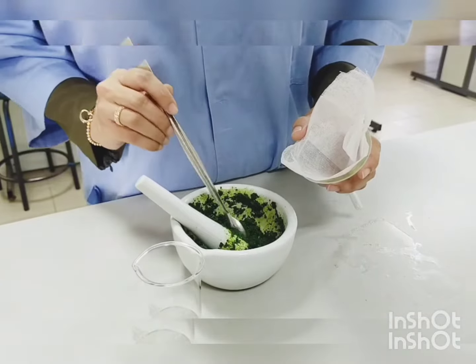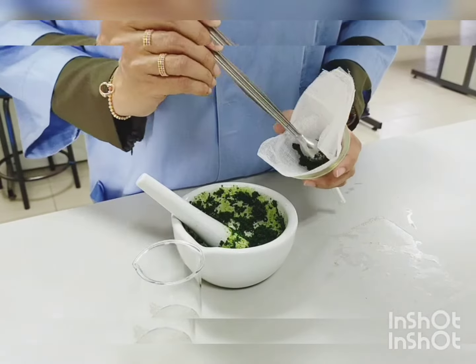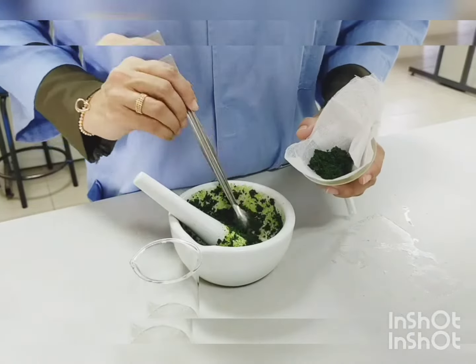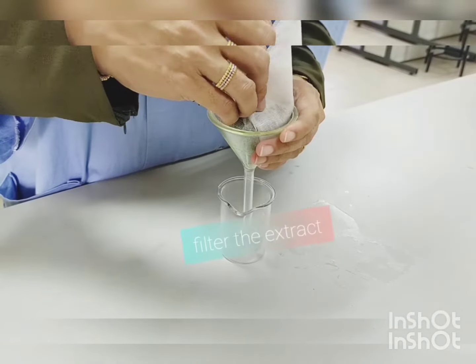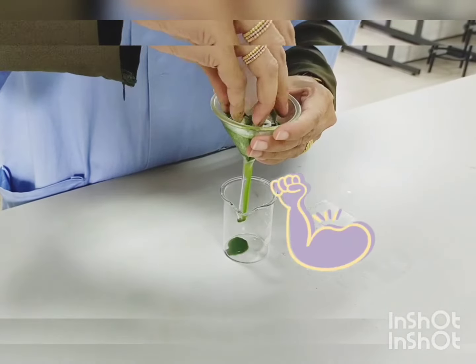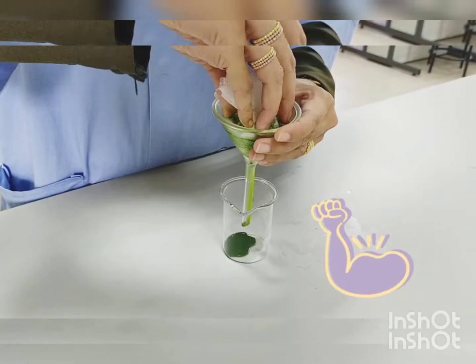Using a spatula, transfer the grinded leaf onto the muslin cloth. Using muslin cloth, filter the extraction. To ensure more extraction are out, you can use your hand to press on the muslin cloth.